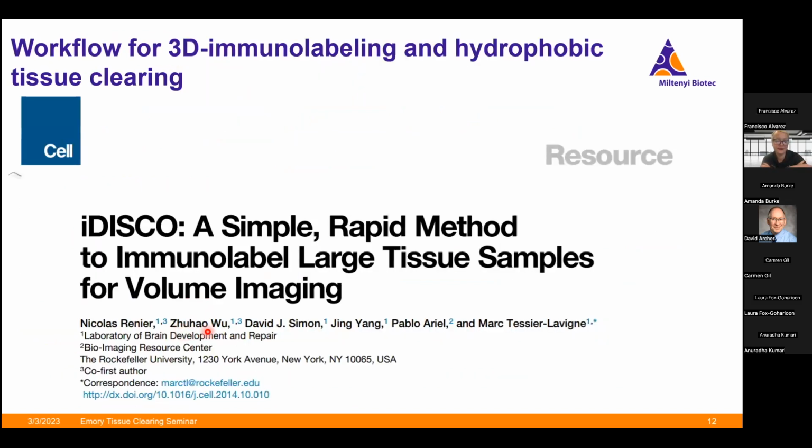3-disco may work fine in some cases where maybe you have a really robust fluorescently tagged viral vector, so a lot of high expression, or if you just need to look at autofluorescence. This allows you to basically extract the organ and move straight into your clearing protocol. But in most applications, immunolabeling is necessary to either visualize or enhance a fluorescent signal. So this requires some pre-treatment prior to clearing, and this is where I introduce iDISCO to you, and this is where that I comes in for immunolabeling.